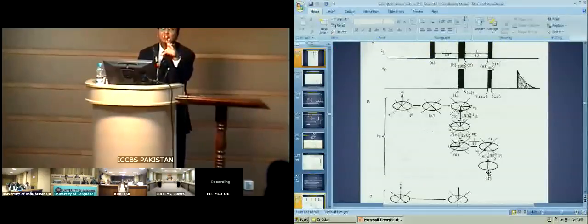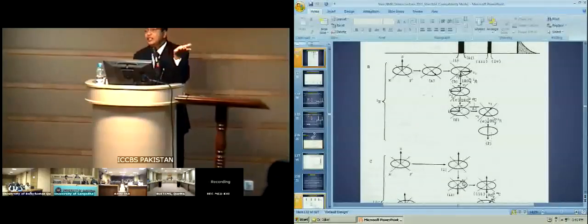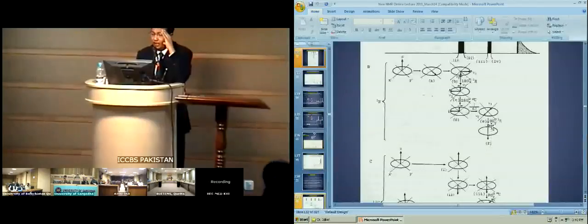The transverse magnetization becomes longitudinal magnetization, one on the Z side and the other on the negative side. They are shared together, because both of them are on Z. And since both of them are on Z, they are ready to accept the population, and the population is accepted as a whole. This whole thing combined with this adds to plus Z.